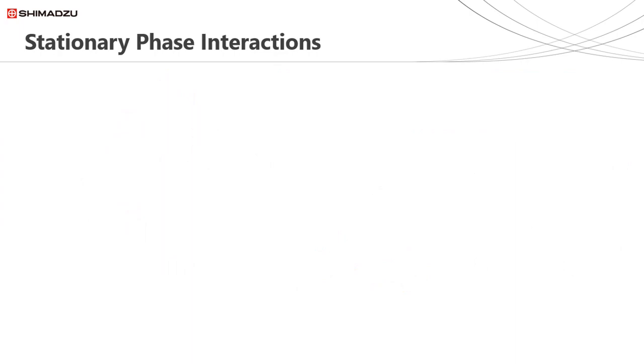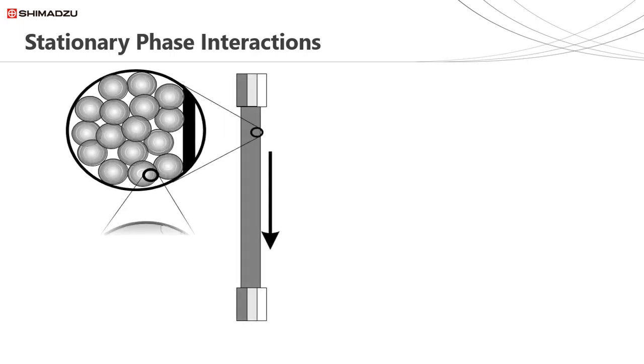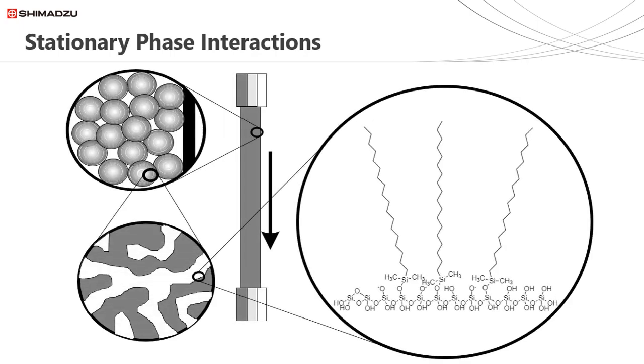Let's not forget that even within reversed phase chromatography, different types of interactions are seen. We looked at the types of interactions we can expect between analytes and the stationary phase. In any separation, we almost never get a pure single mode of separation. In reversed phase, any separation can be dictated by a mixture of hydrophobic interactions, polar interactions, and ionic interactions. Hydrophobic is the major interaction.